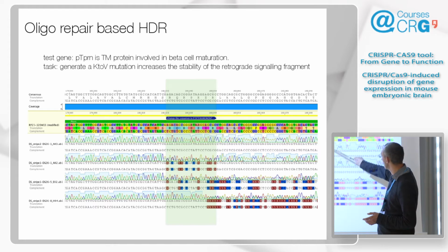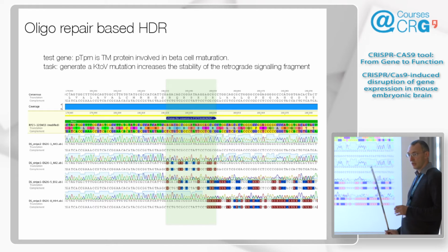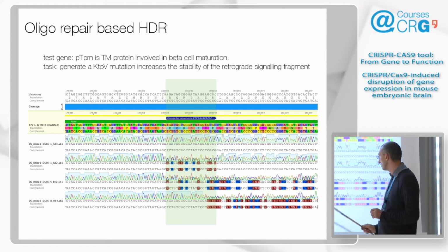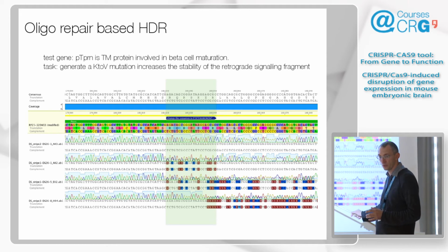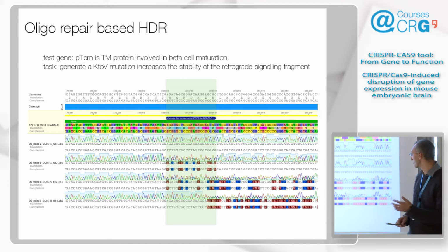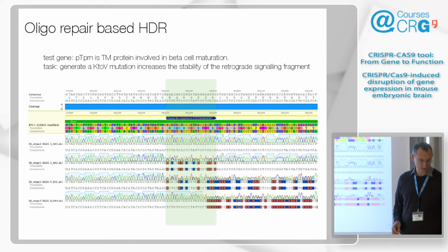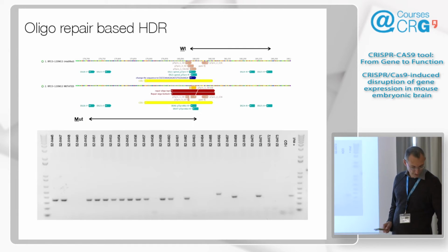The PAM is somewhere here, so it was cut here, and from here on, it's a double sequence. And you see this all the time. And what you should watch out for is, your correct edit on top of a non-homologous edit can look like garbage. And we happened to discard quite some useful animals in the first round of experiments because we just didn't realize it. And then we topo cloned it. It was too late. But this is now all figured out.